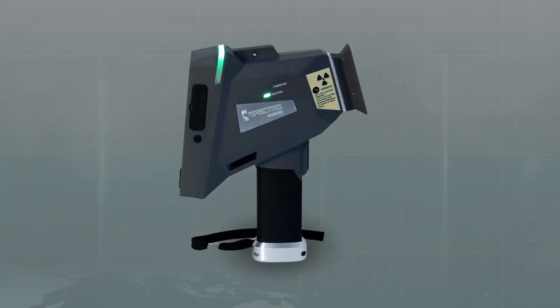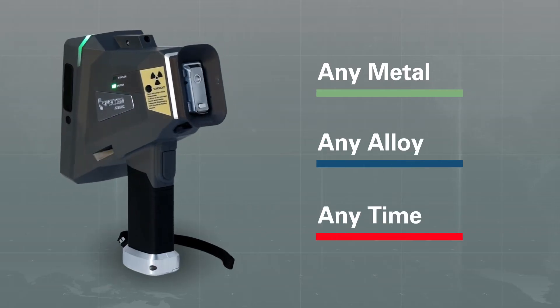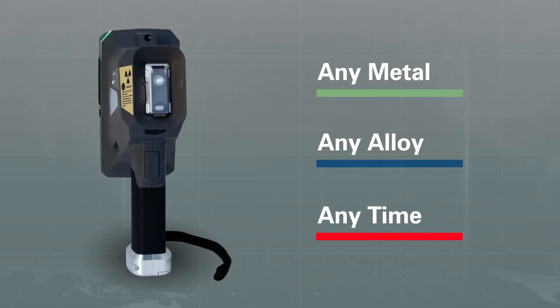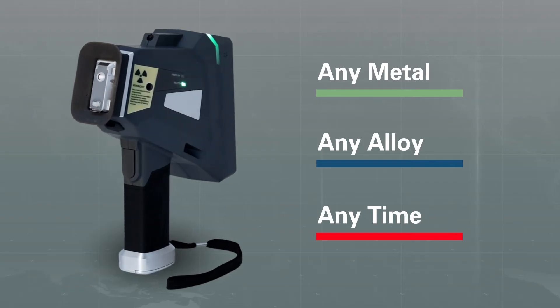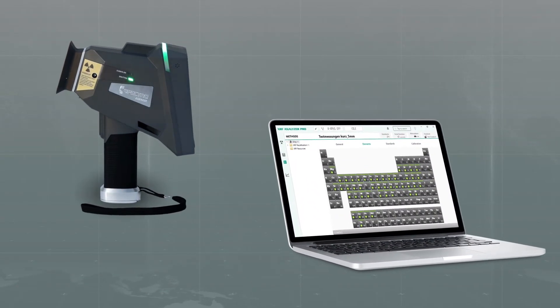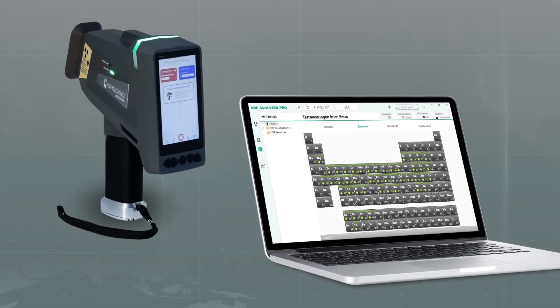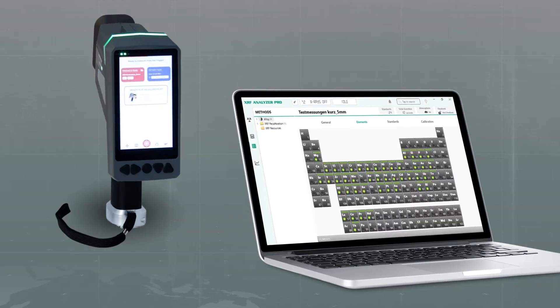Let's focus on a few of those Spectro XSort advantages. This powerful instrument provides outstanding analytical coverage across the spectrum for all common types of metals and alloys. That includes 46 elements in 16 metal matrices. Most users can run any metal, any alloy, any time.